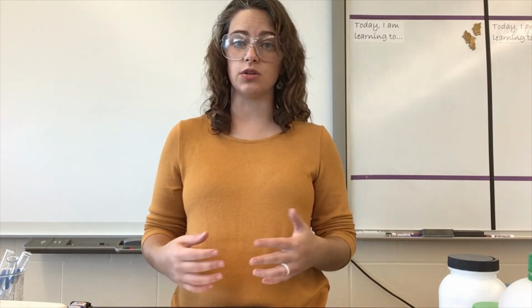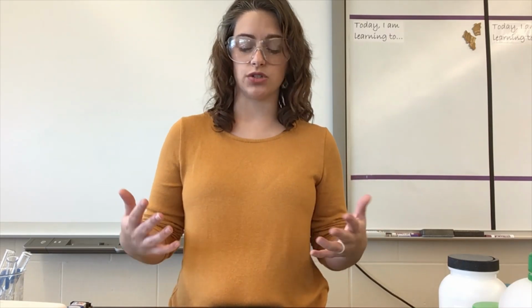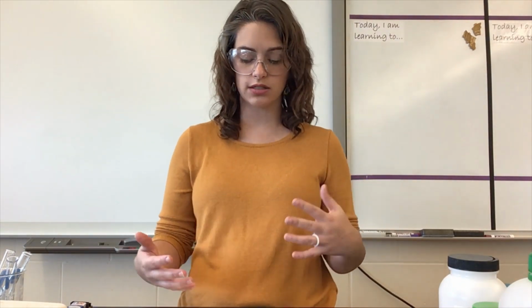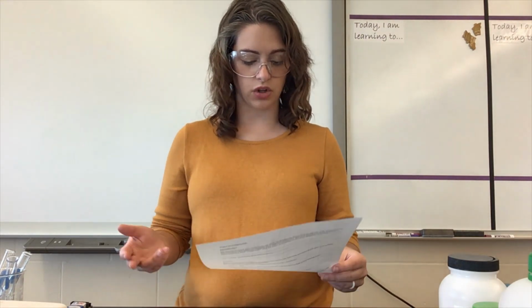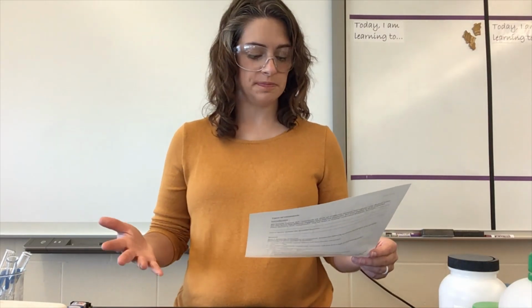So the next thing you're going to do is you're going to start to find some patterns in these properties. So you'll probably see that they, for the most part, divide themselves into two categories. There might be a few that are a little bit odd here or there. And so you're going to look at the differences between ionic and covalent.